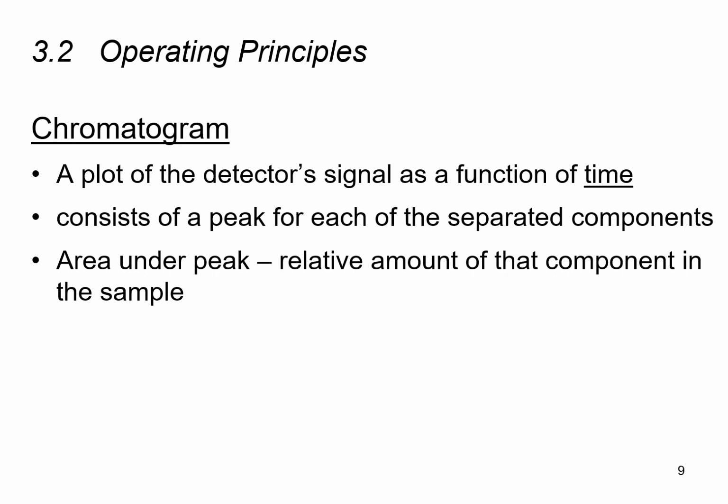These peaks are shown as a function of time on the x-axis, and this amount of time can actually tell us the retention time. So obviously, if a peak comes out very quickly, it will be towards the left of the x-axis, and if a peak comes out very slowly, it will be more towards the right of the x-axis. So this is an indication of whether the retention time is very small or the retention time is very large.